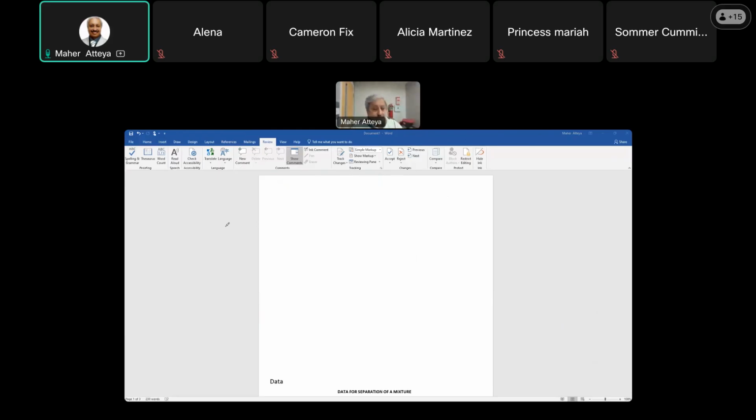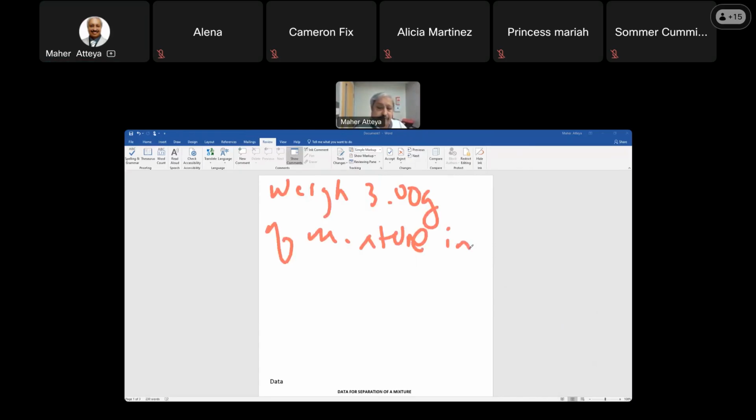So 3. What you will do here, you will weigh out 3 grams. In dish one, you will weigh what? Your mixture, 3 grams. So the first thing here, you will weigh 3.00 grams of your mixture in dish number one.